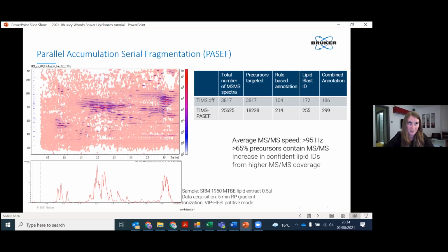And for peptides, it should be similar to lipids in that you have these well-defined building blocks that you can use for CCS prediction. One of the main benefits for peptides is that there are huge databases already, with more than 1 million CCS values, which can be used for CCS prediction models and training set data. So for peptides and lipids, we're in a similar position, and for metabolomics or small molecules in general, there's a bit more work that needs to be done to get more data.